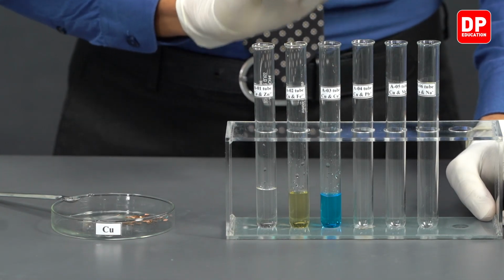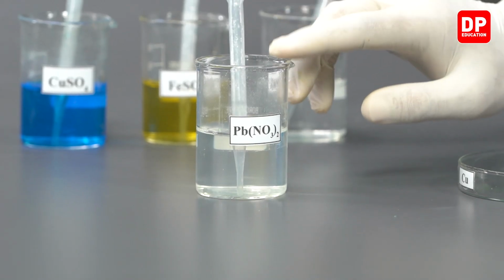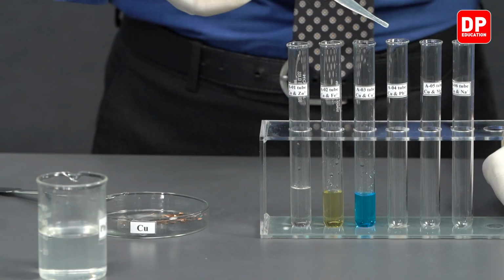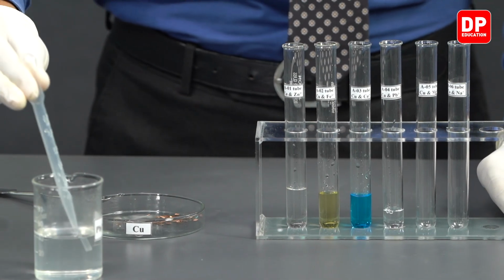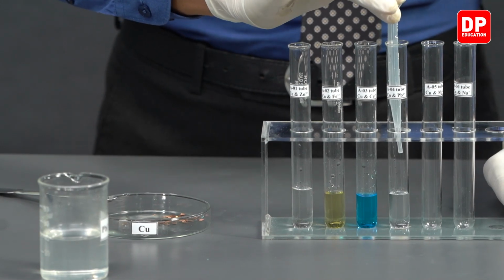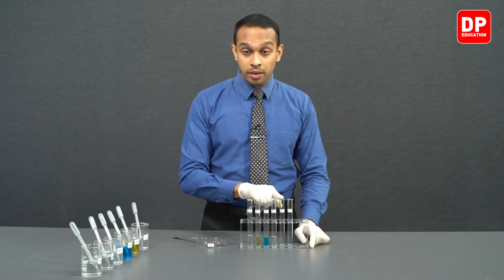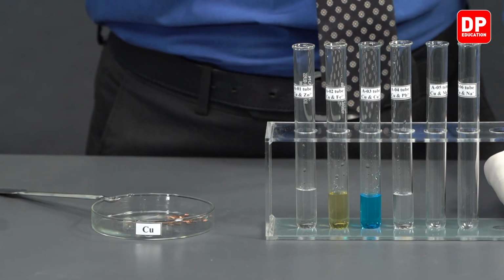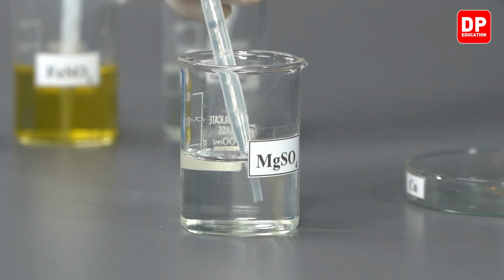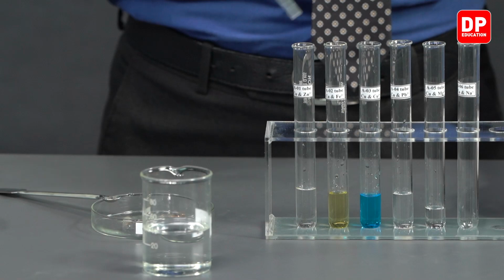And there's another test tube labeled Pb2+ and copper. So to that, we will be adding our lead nitrate solution. And there's another test tube labeled Mg2+ ions added with copper metal. So that means into that test tube we need to take Mg2+ ion solution, which is obtained from magnesium sulfate.